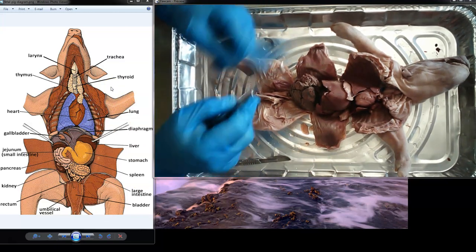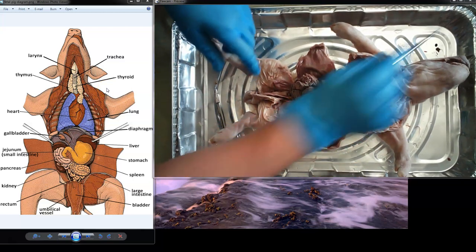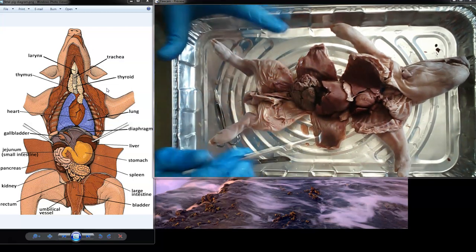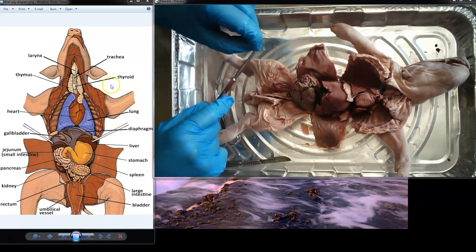Okay, we have another question. Yes, little girl. I thought that was the brain. It is not the brain. No, the brain is up here in the head, over there, and maybe we'll cut it open. We might cut the snout. Okay, ready? I'm gonna show you that. There's a lot of questions from somebody who only raised their hand once.